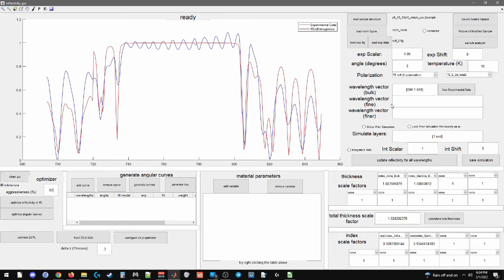If you let that run for 8 hours overnight while you're asleep, maybe it'll do like 50 runs total. When you wake up, you turn off infinite tune, and once it finishes the current algorithm, it'll take the best out of those 50 runs. It'll put the values into the GUI window, and then it'll run the simulation one more time just to show you the best fit, and it'll be done.